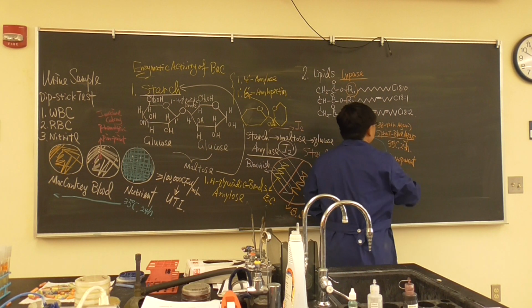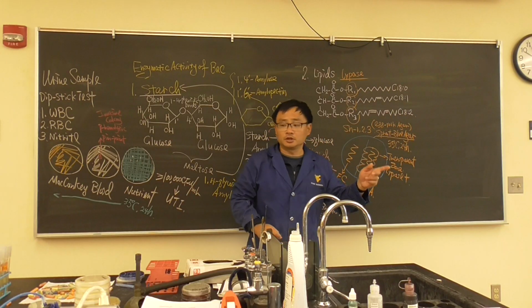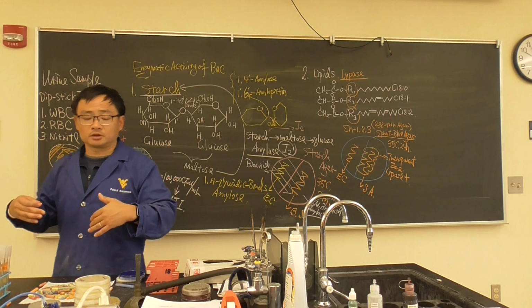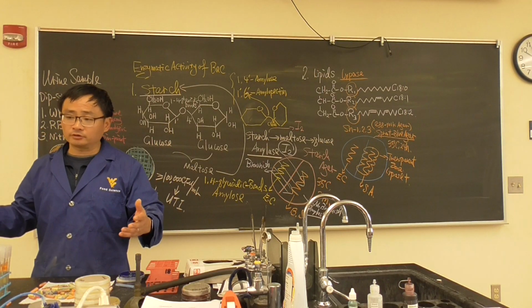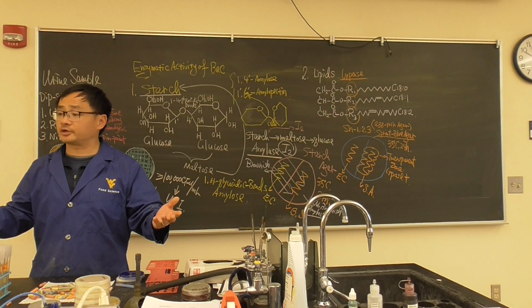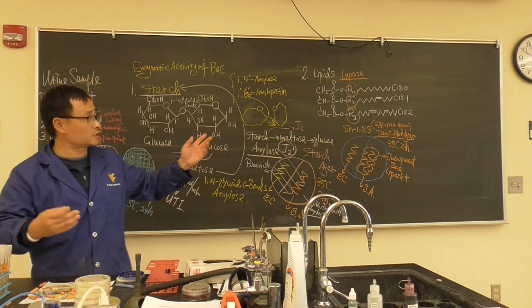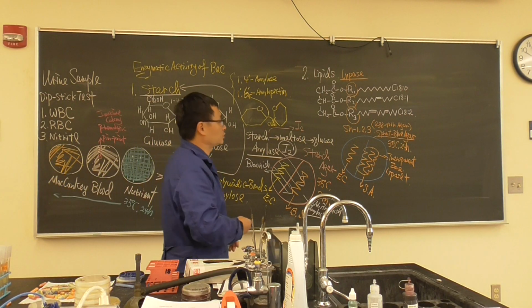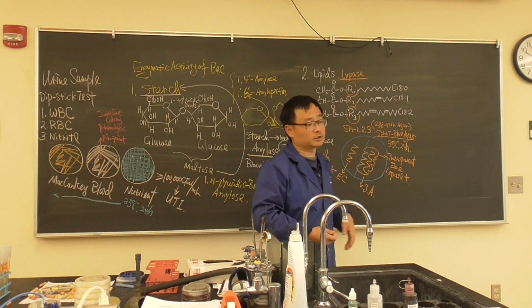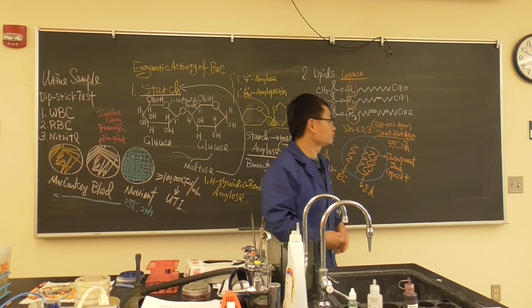We don't have it here because egg yolk is rich in numerous different types of lipids. So that's why we can use egg yolk agar. Sometimes we don't have spirit blue agar. Okay, that's a little bit yellow color.